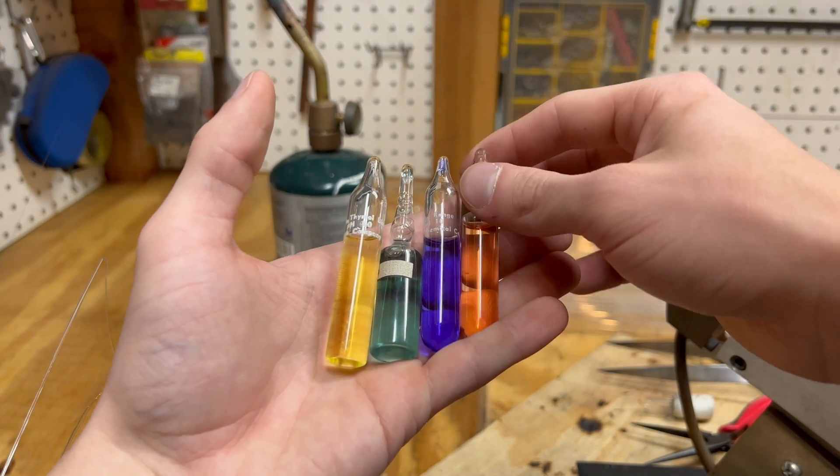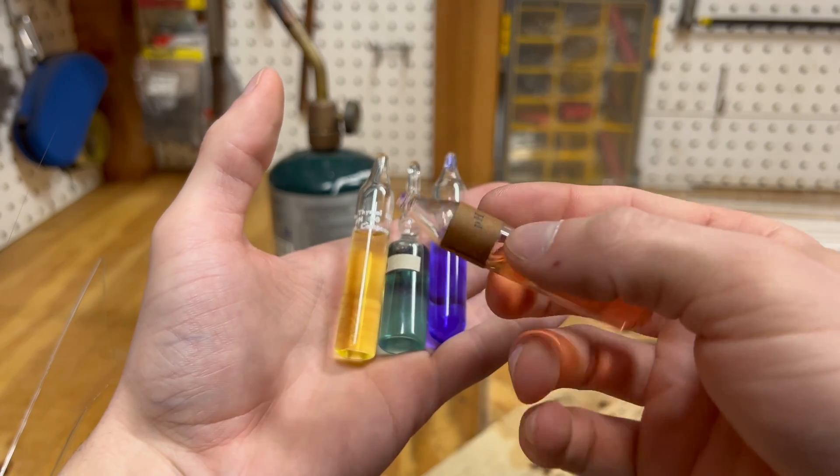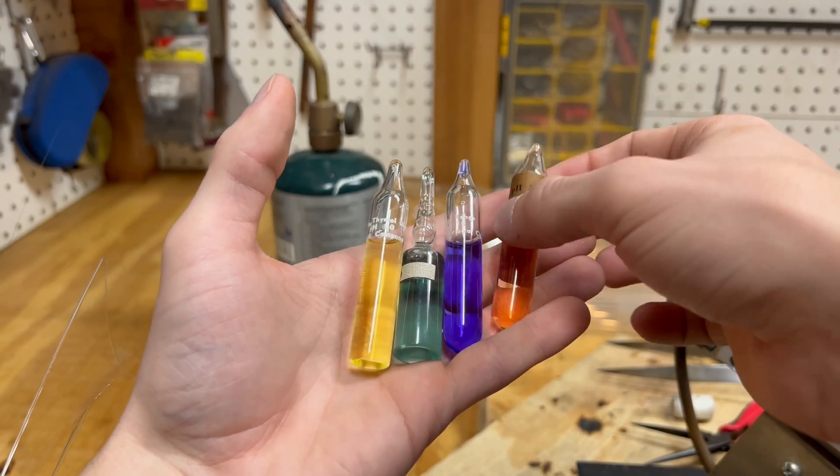If you're going to do chemistry, learning how to make an ampoule is something that you need to know. Even if you only learn one glass working technique, this is the one to know.